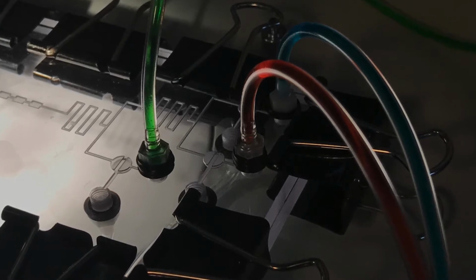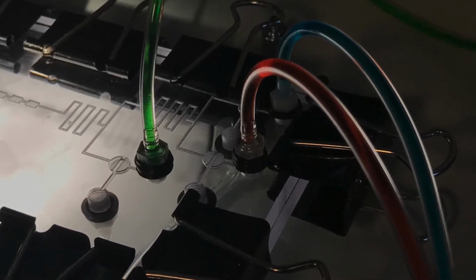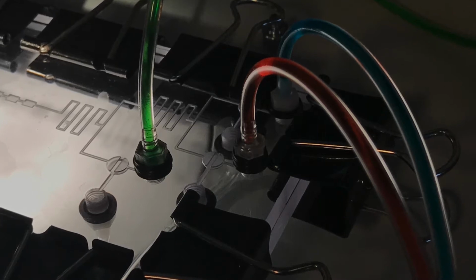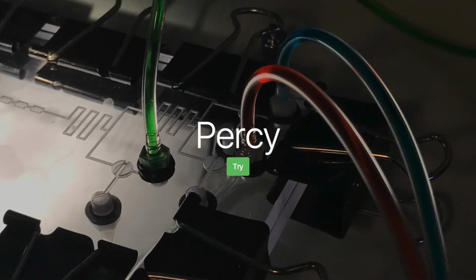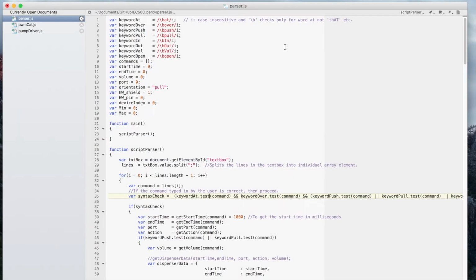Traditionally, microfluidic devices are manually controlled, but what if there was a way to automate them for ease of use and reproducibility? Let me now introduce our tool, an extension of Neptune, called Percy. Here are some snippets of our code.